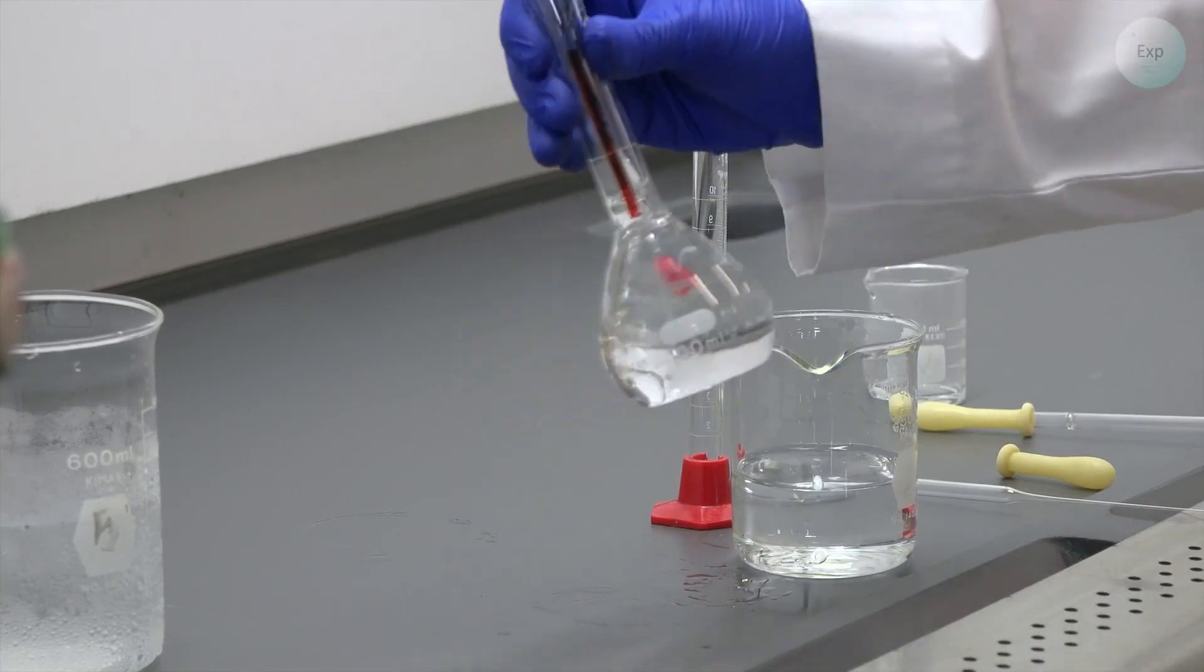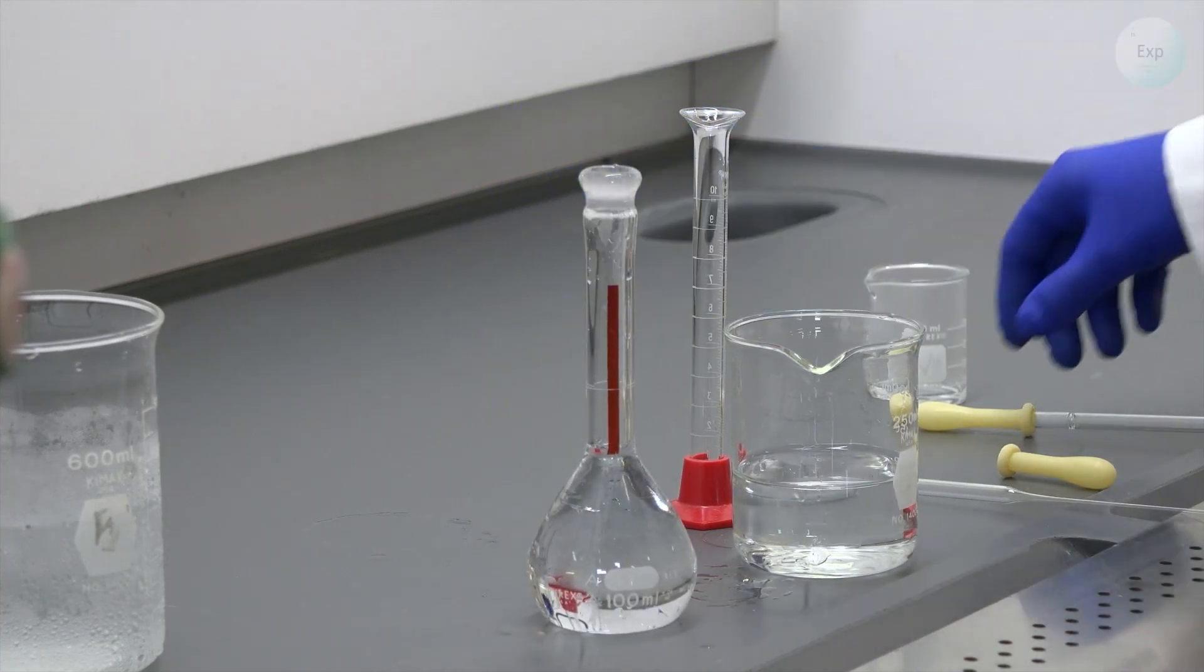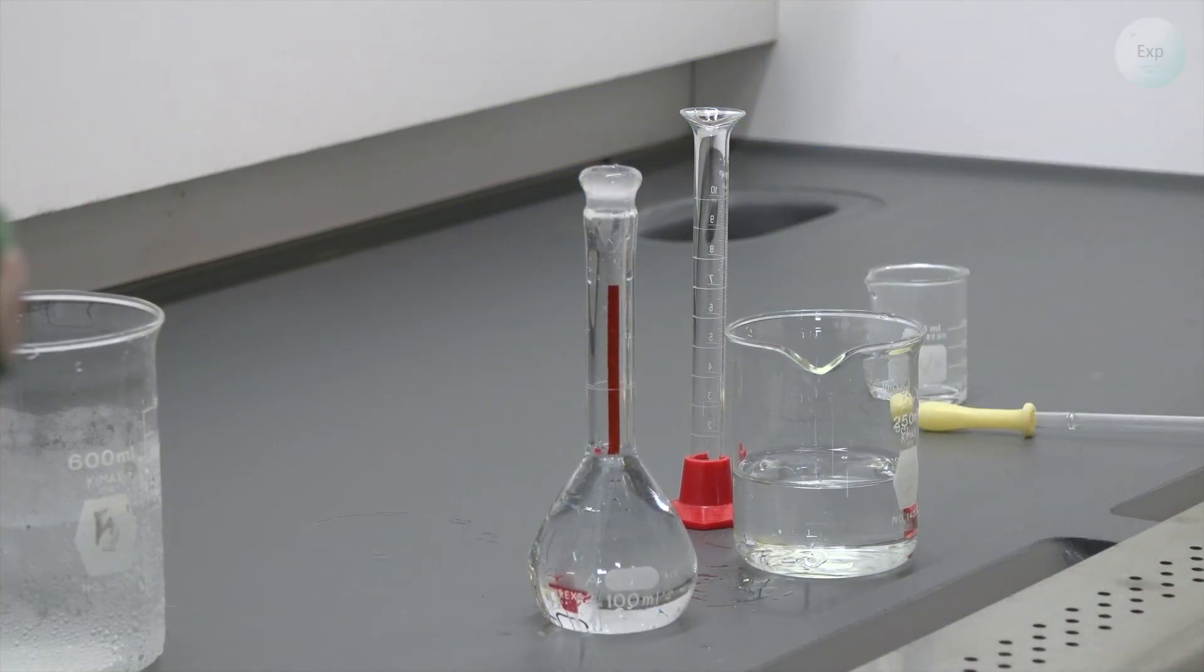At this point, swirling becomes extremely difficult. And we are close enough to the neck to transition to a pipette.